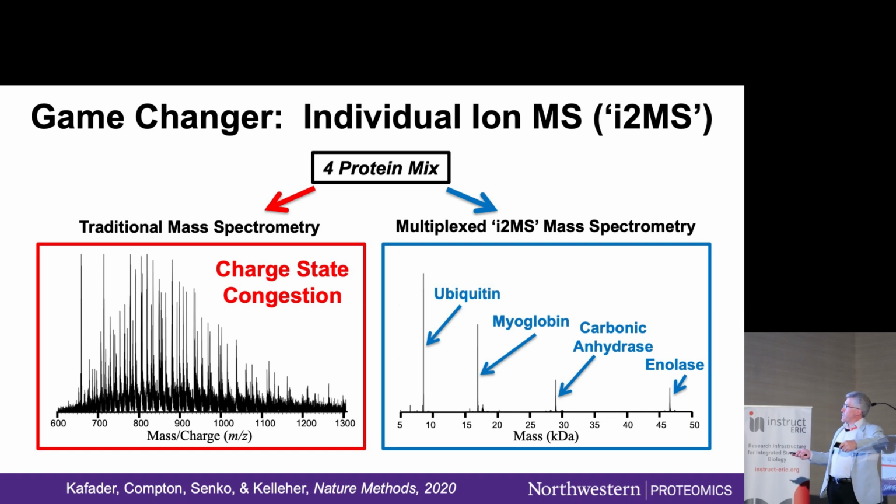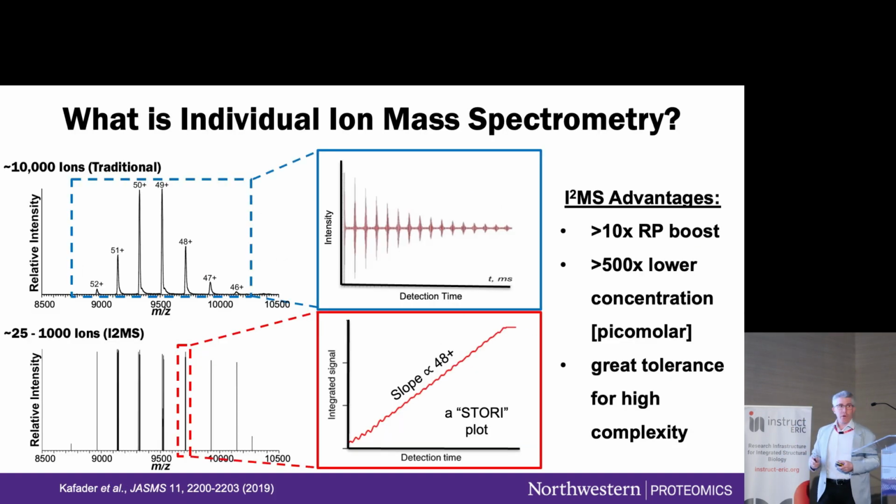So this is the innovation: now the mass spectrum is produced directly. I'll tell you a little bit about how it works, and in the Q&A, maybe more if people are interested. Here, it's a simple idea: 4 proteins, 4 signals, and there isn't a roll-off in the detection at high mass. So this technology gets better the higher the mass is, and it's because of how it works.